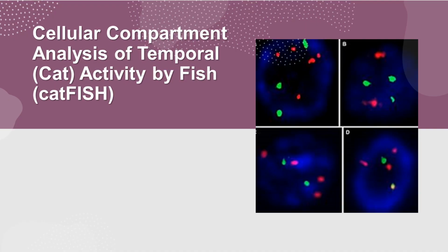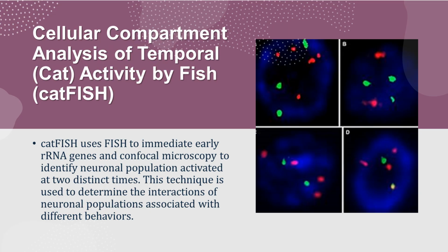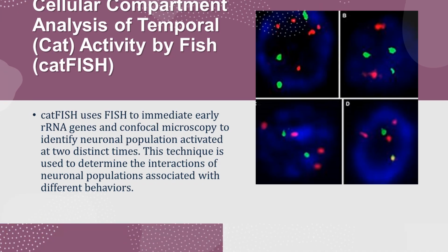Cellular compartment analysis of temporal activity by FISH, catFISH. CatFISH uses FISH to detect immediate early RNA genes and confocal microscopy to identify neuronal populations activated at two distinct times. This technique is used to determine the interactions of neuronal populations associated with different behaviors.